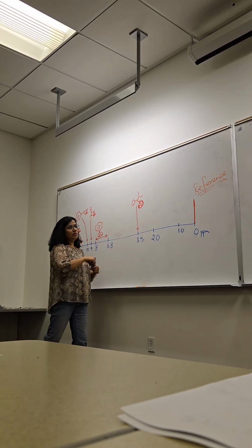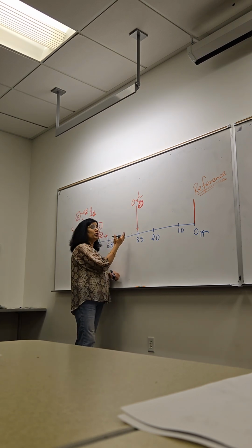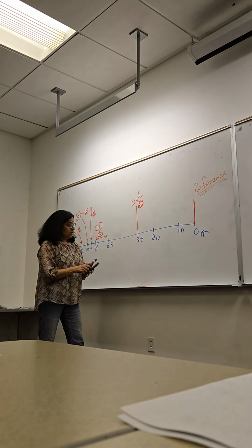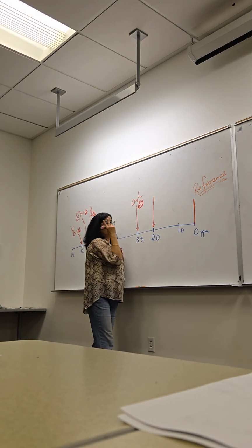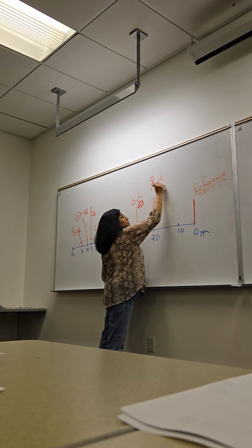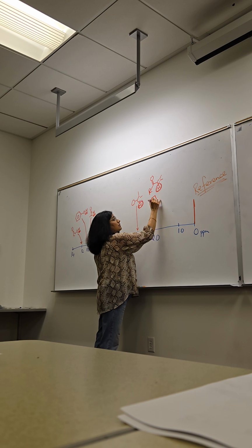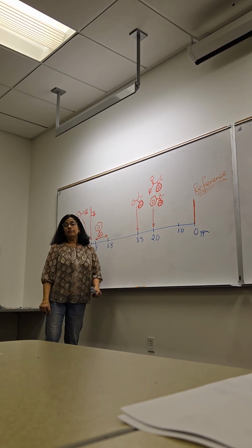And again, remember, methyl is less than methylene, less than methine, so it can go up to 4, 4.5, so on and so forth, but starting here, you can go higher depending on what kind of hydrogen that is. 2, this is where two kinds of hydrogens show up: either the ones that are next to a ketone, or next to a benzene, the benzylic hydrogen.